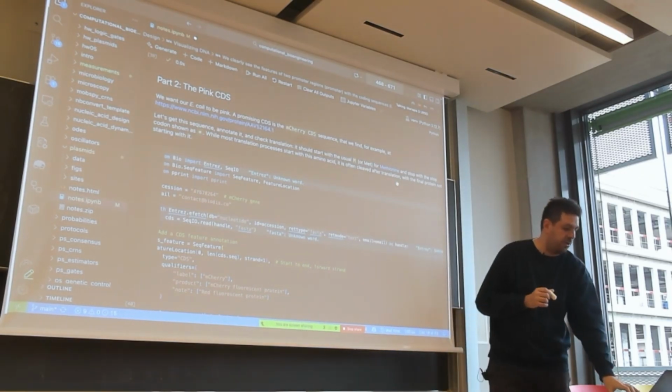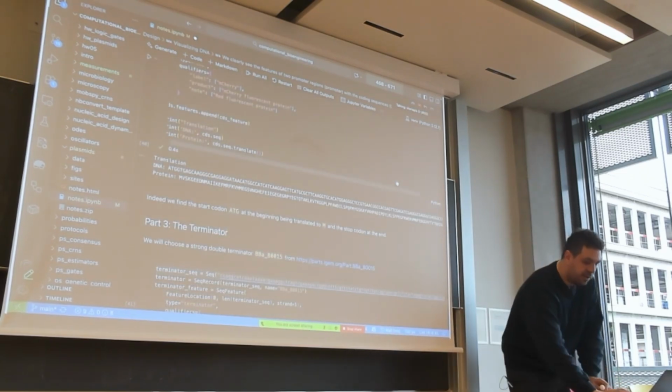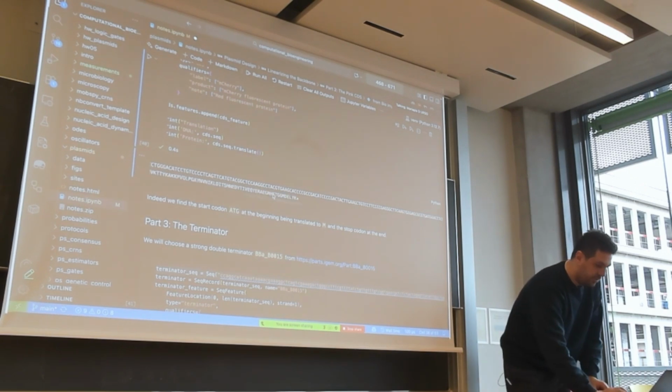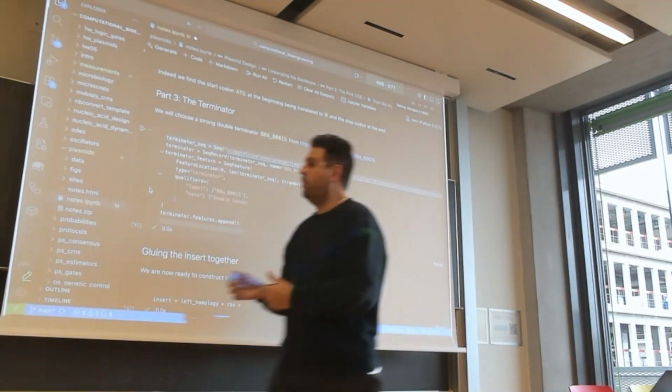But you should always find this M in the beginning. And another thing we should always find, unfortunately, yes, it does that, we should always find a star. That means there's a stop codon in the end. So everything is fine here. So we did that.